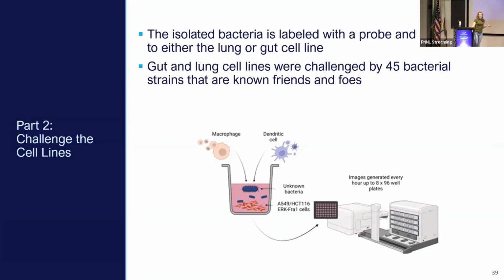And so these human cell lines, we have different spots in our body that can get sick. Common ones are the gut and the lungs. Different pathogens will infect those areas of our body differently. And so they did look at 2 different cell lines, gut and lung, and they started off creating this data to create the model with knowns. So this goes back to what Sam was saying about there was a question as, is scientific data labeled or unlabeled? Labeled if you make sure it's labeled.